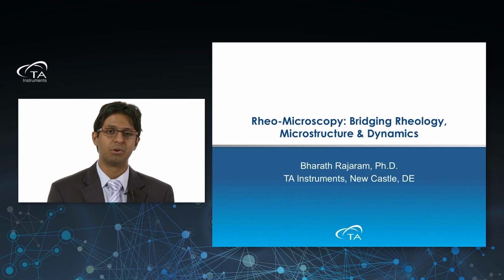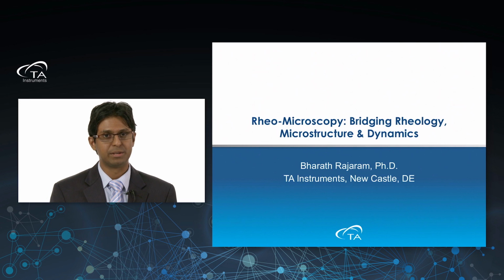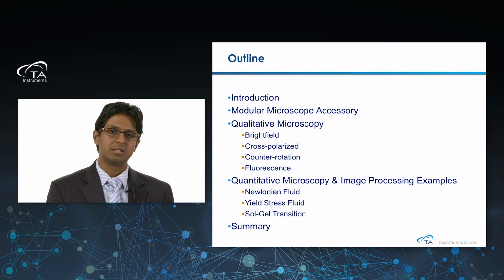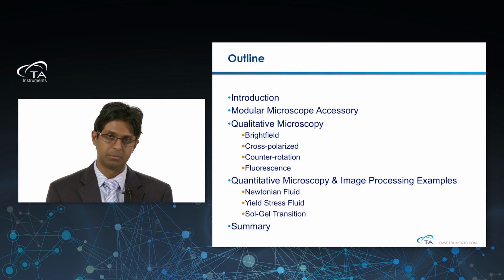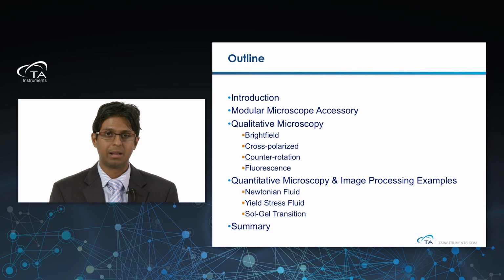Hello and welcome to today's webinar, where I'll talk about using optical techniques, specifically microscopy, to explore relationships between rheology and a sample's microstructure and its dynamics. Today's talk is outlined as follows. I'll start off by introducing examples from published literature where microscopy has been used to gain insights into sample deformation, rheology, and its microstructure. I'll talk about the new modular microscope accessory that's available for the DHR rheometers. And I'll talk about specific examples using both qualitative and quantitative microscopy across a wide spectrum of samples to highlight how microscopy can be used to understand structure.